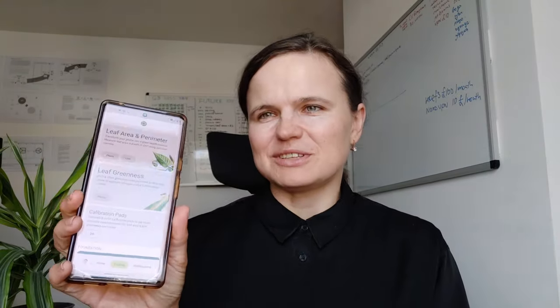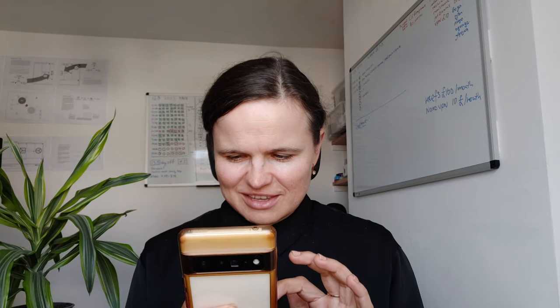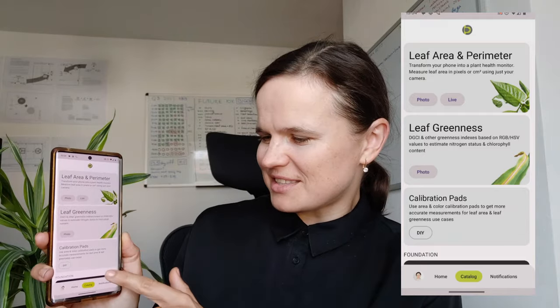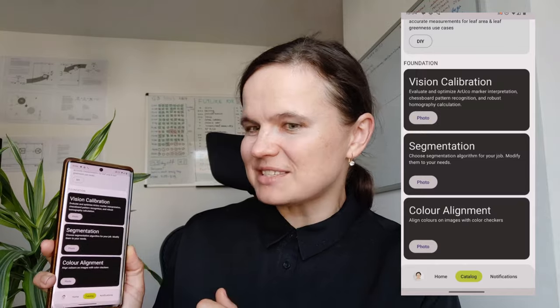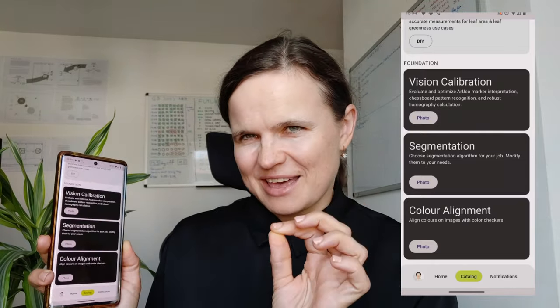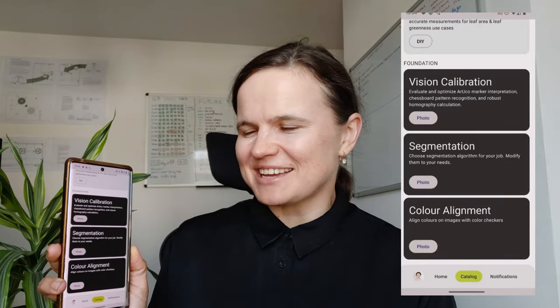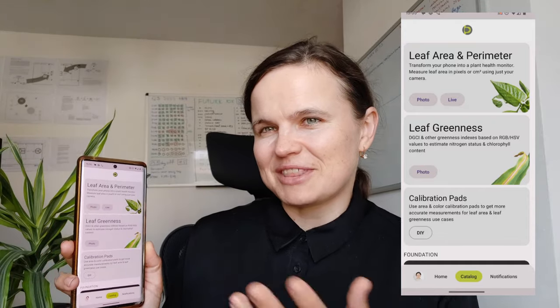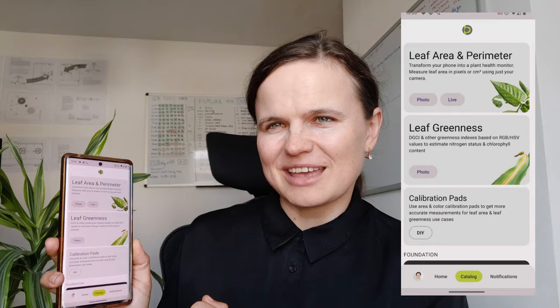Let's start from the beginning, from the dashboard. Here you can find the main screen — the main dashboard. This screen consists of two parts. The first part includes the modules which you can use, and the second part is all about Foundation — that's a little more advanced and I will explain it at the end of this practical session. So let's start with the overall basic level, which you can use even now.